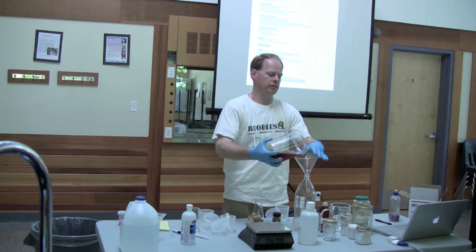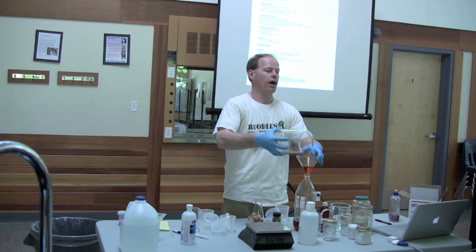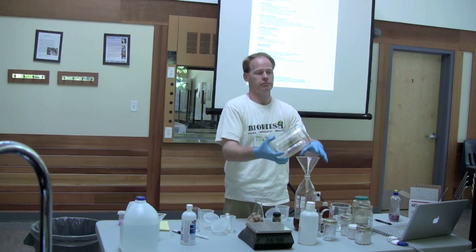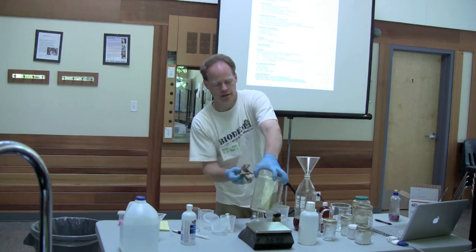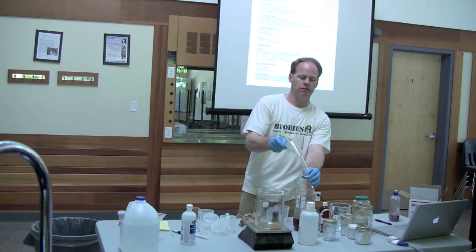I'm going to make a half-liter batch, basically. Is that small amount of moisture in the bottle going to cause a problem? Yeah, but I'm going to whack this thing good and hard. Remember I rounded up? So instead of adding 5.5 grams, I'm going to add 6. I'm going to really whack it.